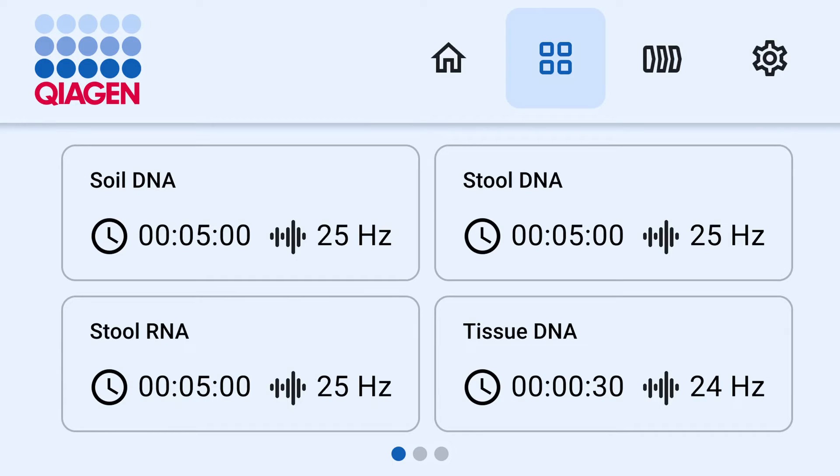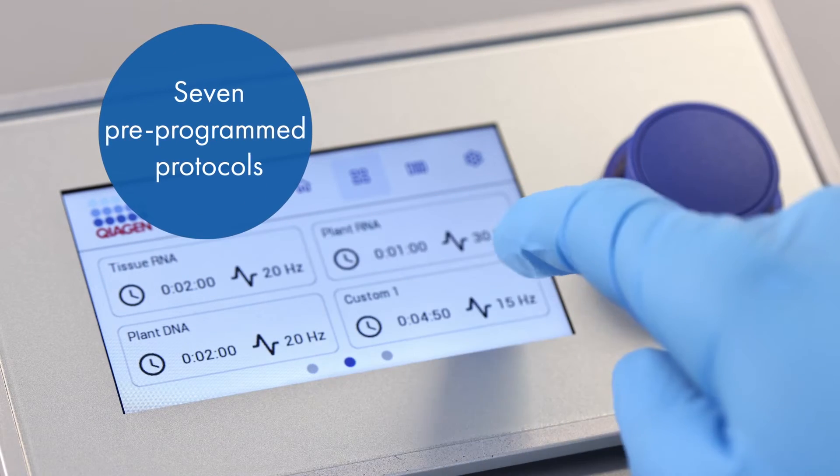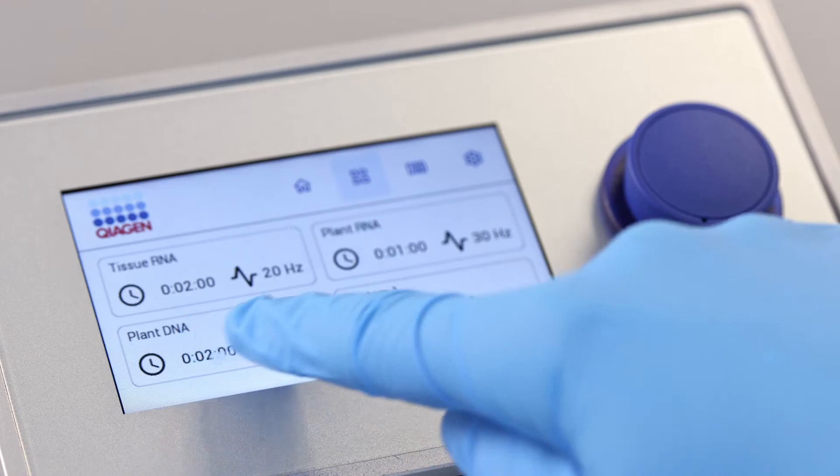The Tissalizer 3 can save up to 12 disruption programs — seven of them are pre-installed and five are customizable. Swipe left or right to view the other disruption programs.